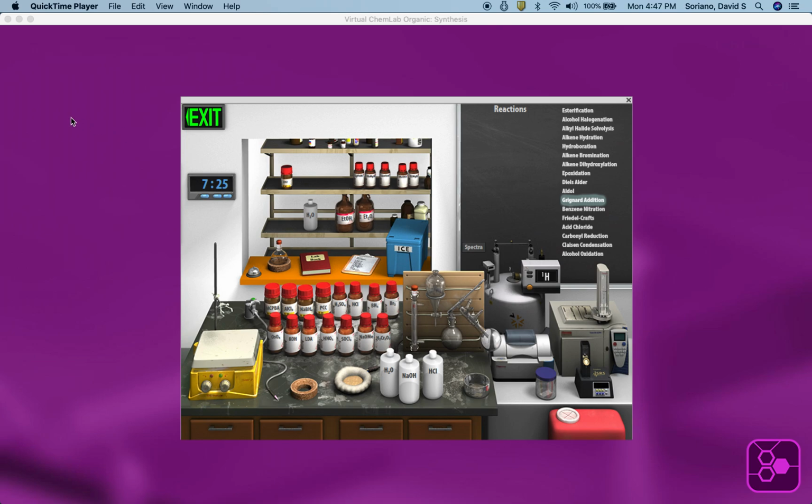Because I'll be teaching Organic 1 Lab this summer completely remote, I'm utilizing BeyondLabZ Labs software, virtual organic chemistry. There are modules for general chem, biology, physics. I have not looked at those, but what I'm doing in this installment is showing you, the viewer, how a Grignard would be conducted in the lab.